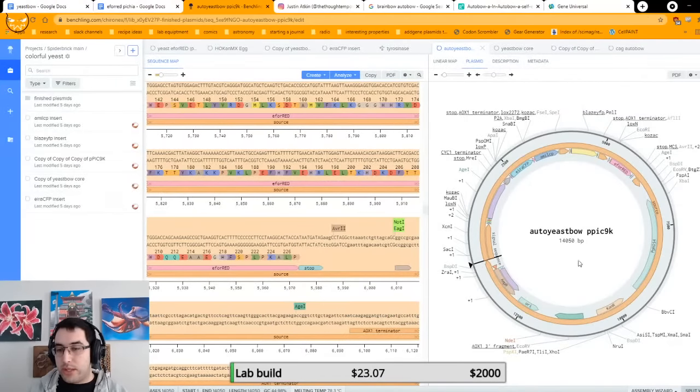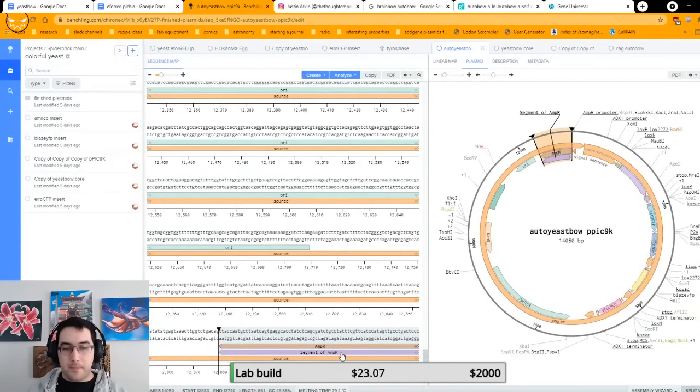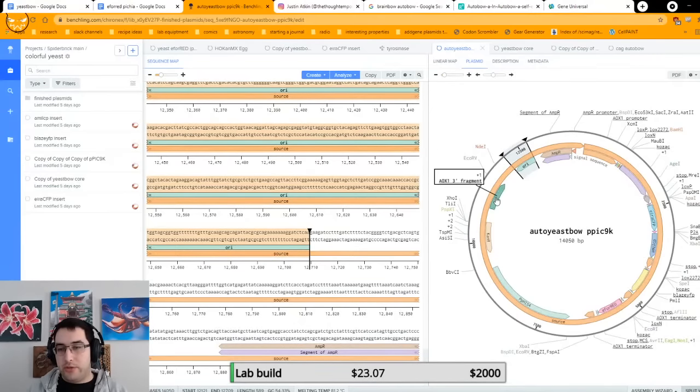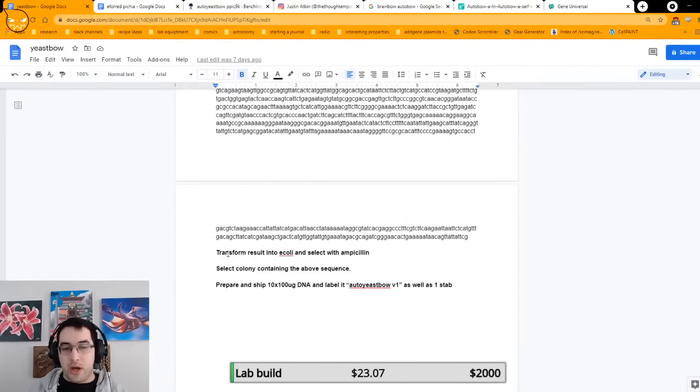The reason I say this is because if you look at the plasmid, you'll see this bit that says AMP-R. AMP-R is ampicillin resistance. Ampicillin is an antibiotic in the penicillin family, and it's essentially the one that everybody uses when working with E. coli to just select the ones that have been modified. It also has an ORI, which is another piece that you need for this to work in E. coli. So basically this is saying that if you put this plasmid into E. coli on plates that contain ampicillin, the only colonies you'll get on that plate contain this DNA. Cool. Now we're going to assume that they've done that correctly and they have the DNA in E. coli.